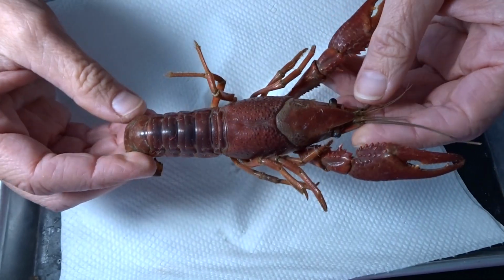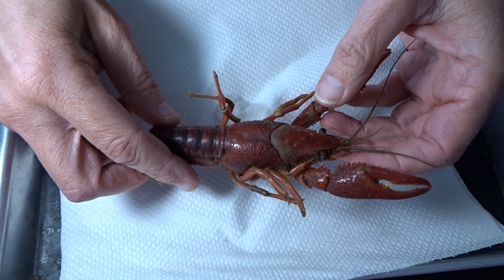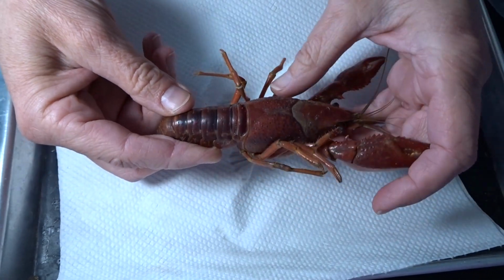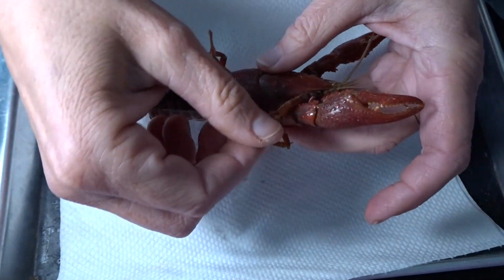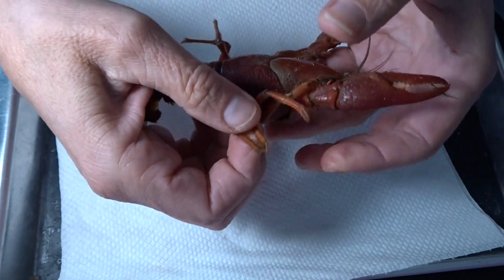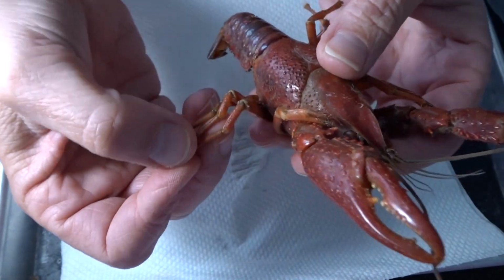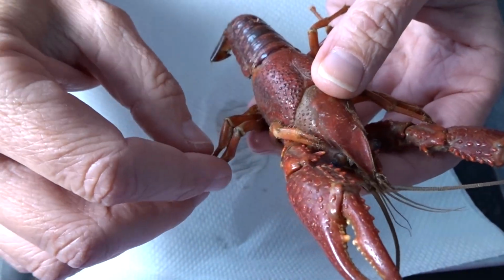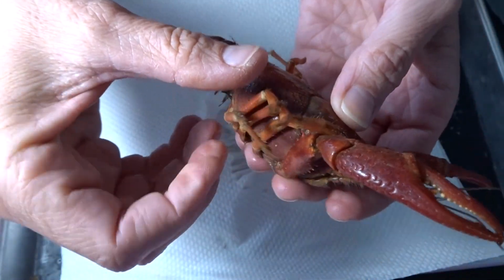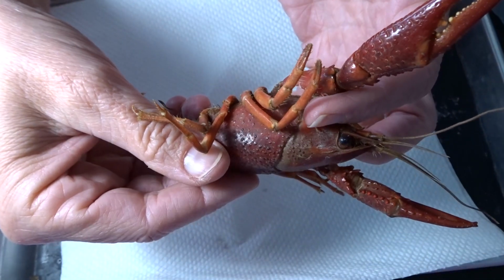What I wanted to share with you that they did not show you in here or the videos is they didn't spend a lot of time looking at respiration. So what we would do is, you guys have all these walking legs, right? And they showed that they can bend in all different directions, right? So they have these hinges, so they can bend this way, that way, and that aids in its motion. Obviously, very important evolutionary advantage.